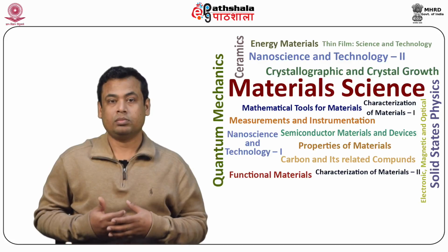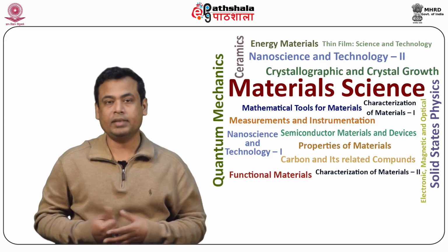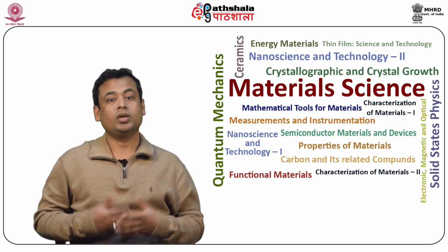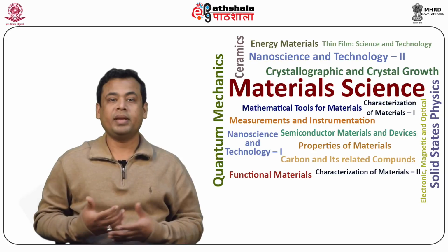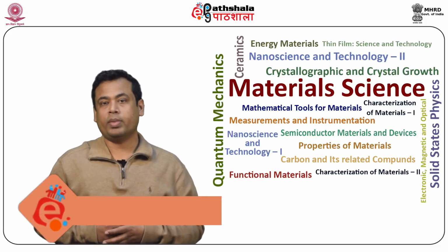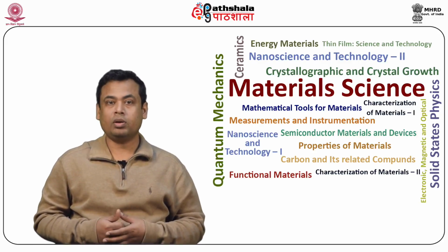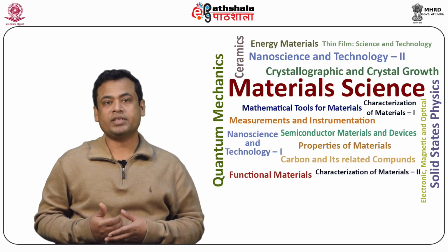Filter fluorometers and spectrofluorometers are utilized to record the fluorescence spectra. Fluorescence spectrometry is used in many areas of biology and medicine, and the filters or monochromators are normally used to remove the pollution or stray light from the wavelength that is used to excite the sample.